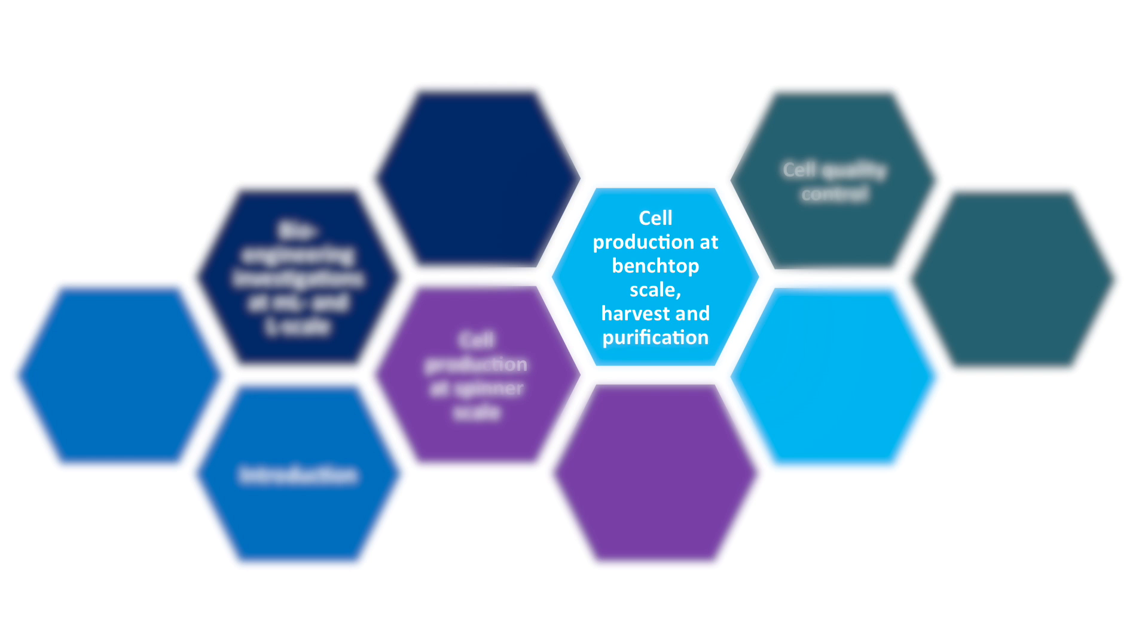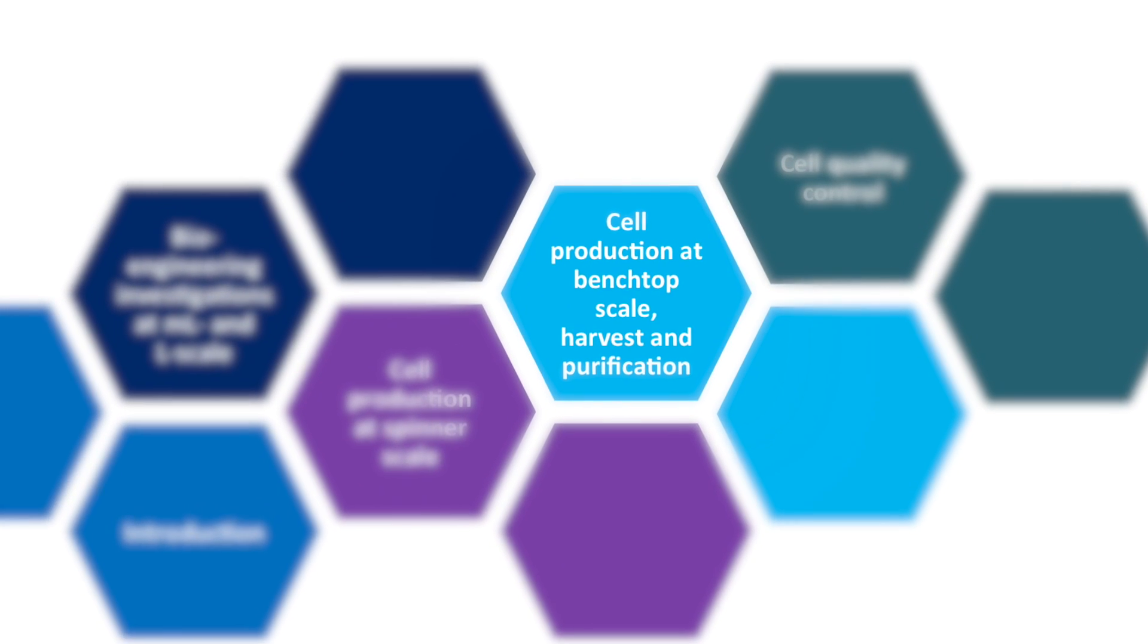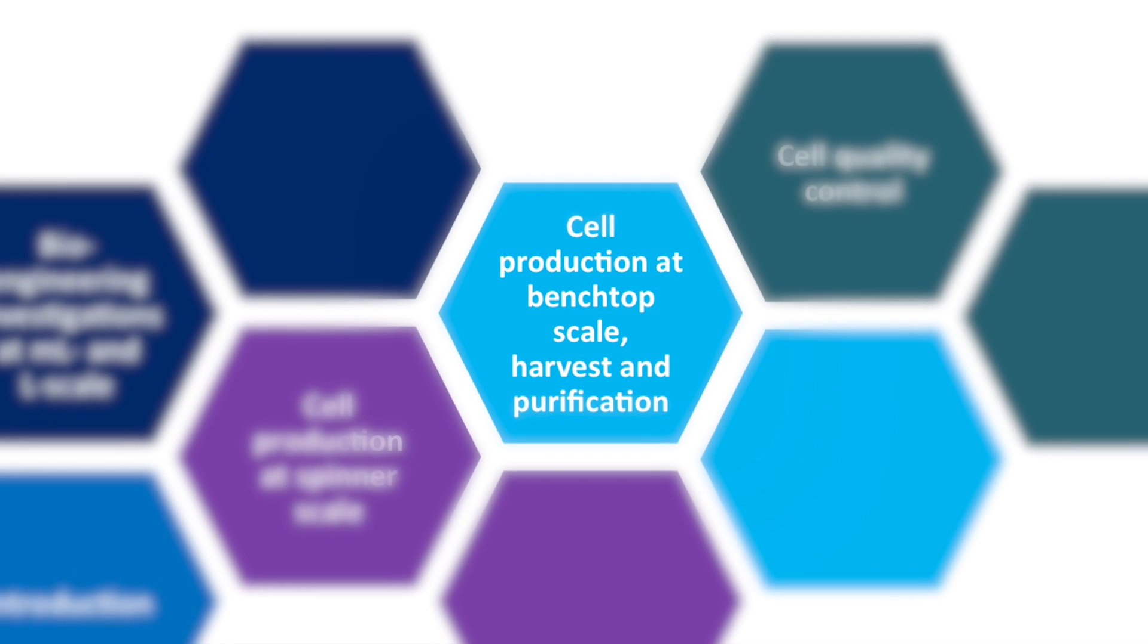In this section, we focus on microcarrier-based cultivation in a stirred benchtop bioreactor, the Universal SU from Sartorius Stedham Biotech.